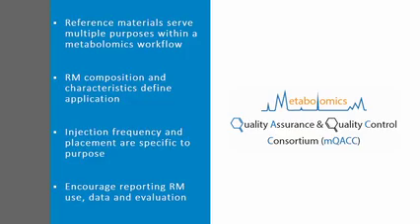So just to wrap it up, reference materials serve multiple purposes within the metabolomics workflow. The composition and characteristics define the application. Injection frequency and placement are specific to your purpose. And if you're using reference materials, we encourage you to provide the data, how you evaluate it, and what you are doing to your experimental sample data.